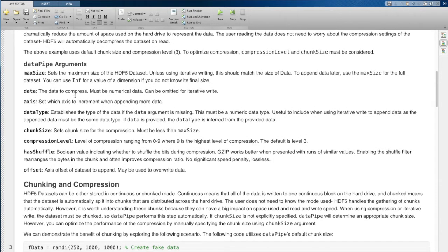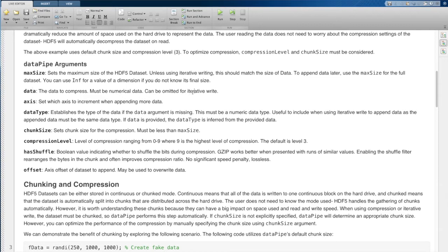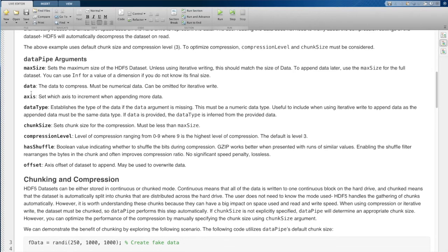The next argument is data. This is simply the data that you are going to compress. If you are doing iterative write, then you don't need to supply this data, you can write an entirely empty data set. The axis argument is the axis onto which you're going to be appending your data.